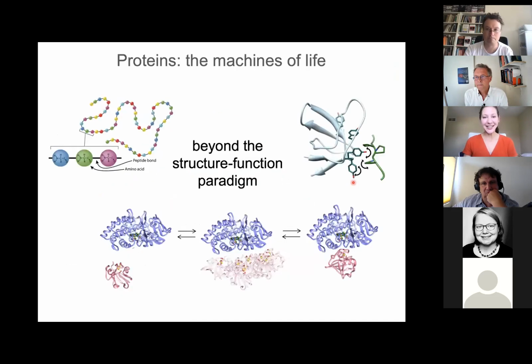As my title said, we are after site-specific 2D IR spectroscopy with the goal of understanding the motions of proteins. Because really the field of biochemistry has gone beyond the structure-function paradigm, and we've now realized that proteins, just like macroscopic machines, are the molecular machines of a cell, and so they really need to move in order to function. So anywhere from small scale changes to really dynamic molecular recognition. This is the aspect of protein function that we're after.